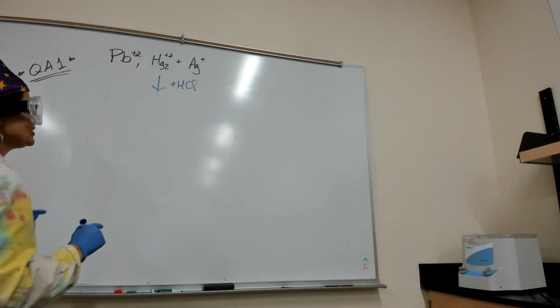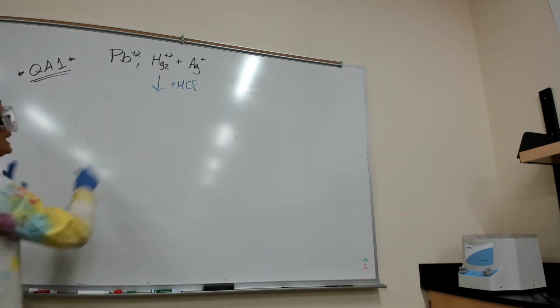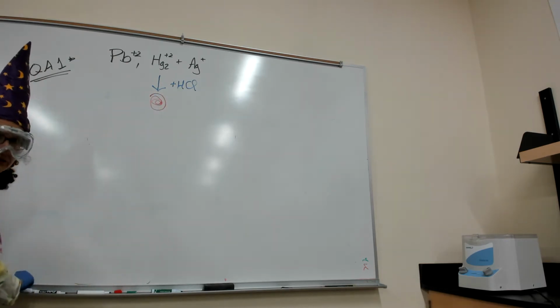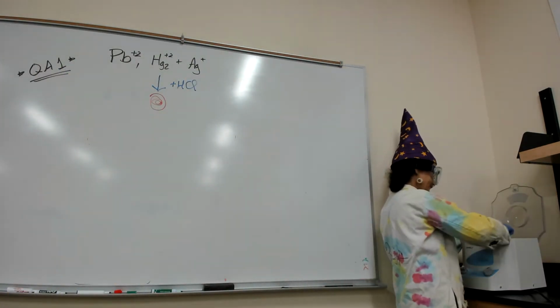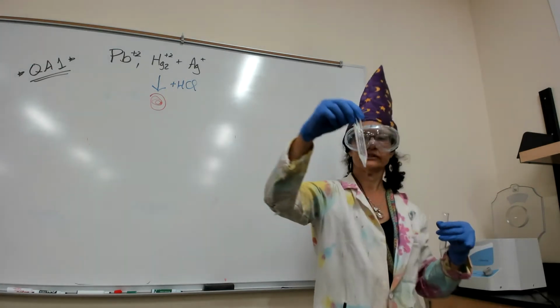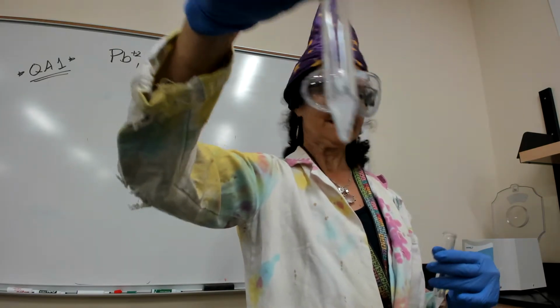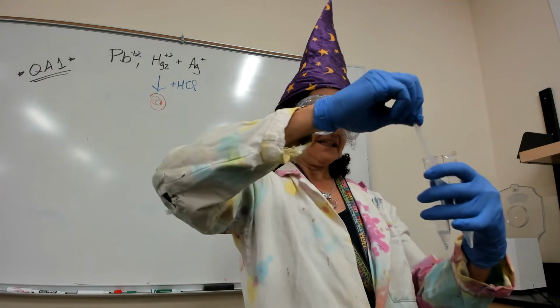So I add the HCl, and what happens is you now have a choice. We're going to put it through our centrifuge. We'll do this red, which means my centrifuge. You can make up whatever symbol you want. And when I centrifuged, oops, I have a few floaties. I don't know if you can see on the camera. It's clarified mostly, and I can use my handy dandy pipettes.